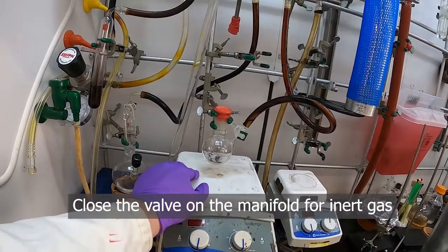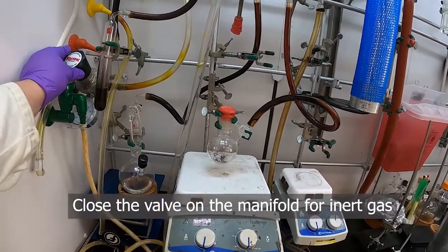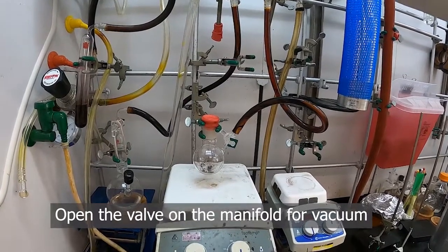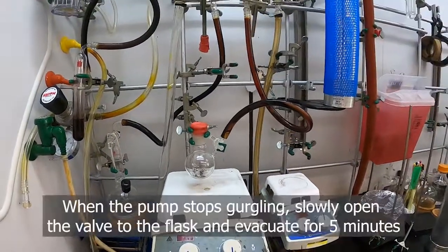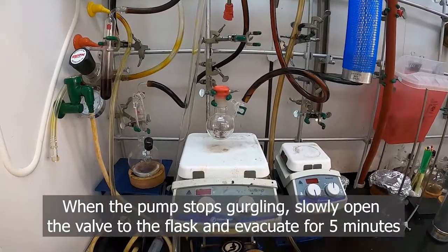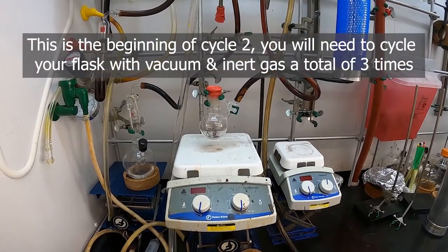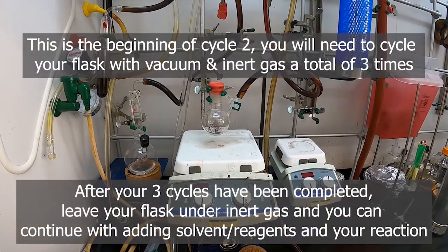Turn off the nitrogen. Open the vacuum. And just repeat like before. And then we want to pull a vacuum on that three times, and then at the very end, leave it under nitrogen to be used for the next step.